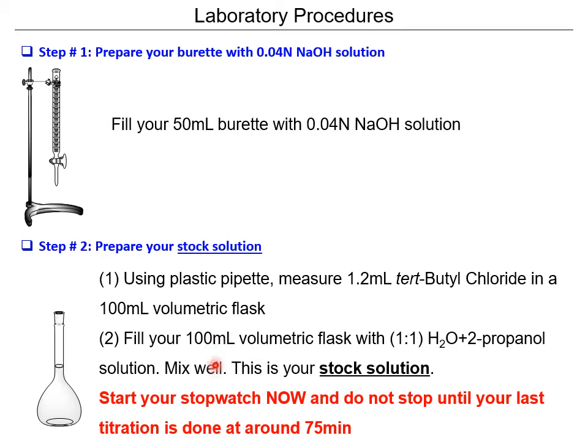This is when you start your stopwatch, right? Because you're measuring the rate, so of course you need to time it. It will probably take around 75 minutes for this reaction to complete.